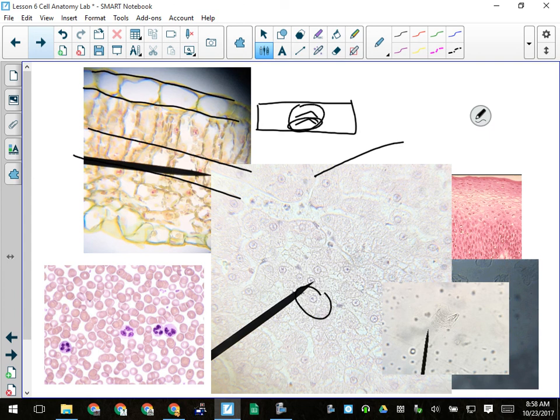Like when we used to do this by hand and draw them by hand, you'd draw one cell, but you were really drawing a conglomerate of, well, I saw it on this one over here. I'm just going to put it in the one that I'm drawing because no one would know the difference. So now you've got many cells. Label what you can using as many cells as you need to.